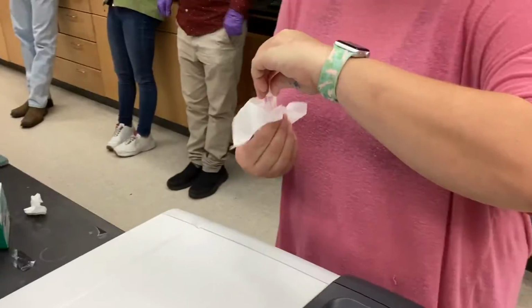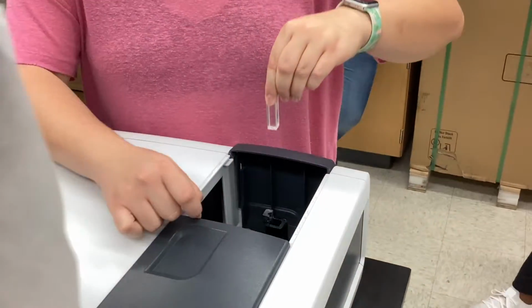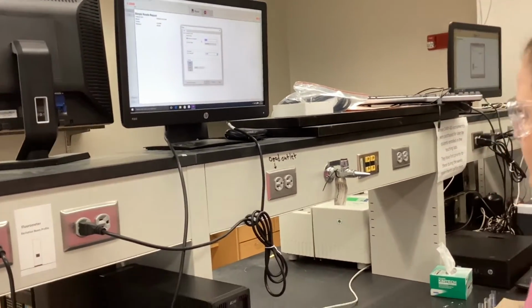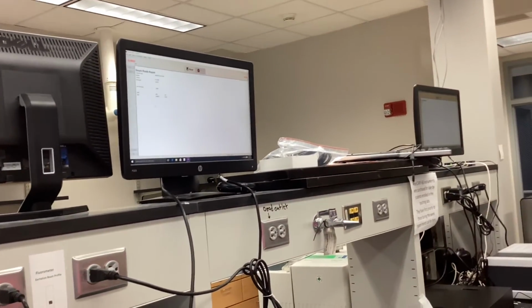In the next part of the video, we're using the lambda max to find the absorbance of each dilution at that wavelength. Now I'm cleaning two sides of the blank. Now I open the machine, place the two clean sides towards the beam, and close the machine. Then I click Setup, enter the wavelength, and then I zeroed it. For this part of the lab, we switched to the program Simple Reads.